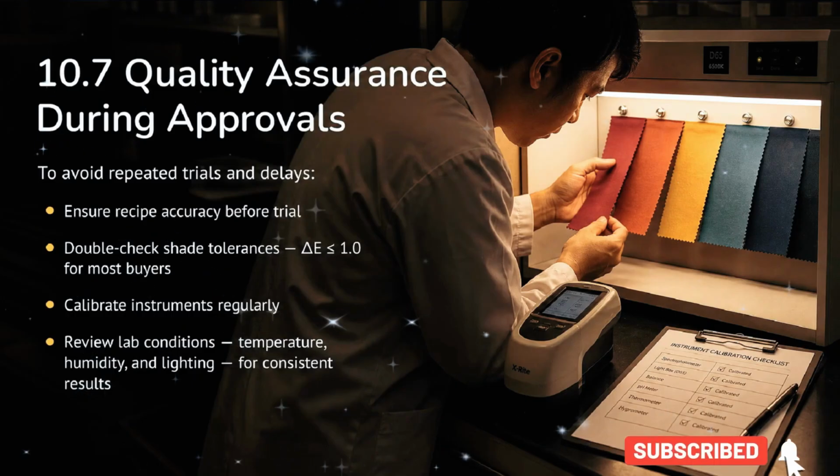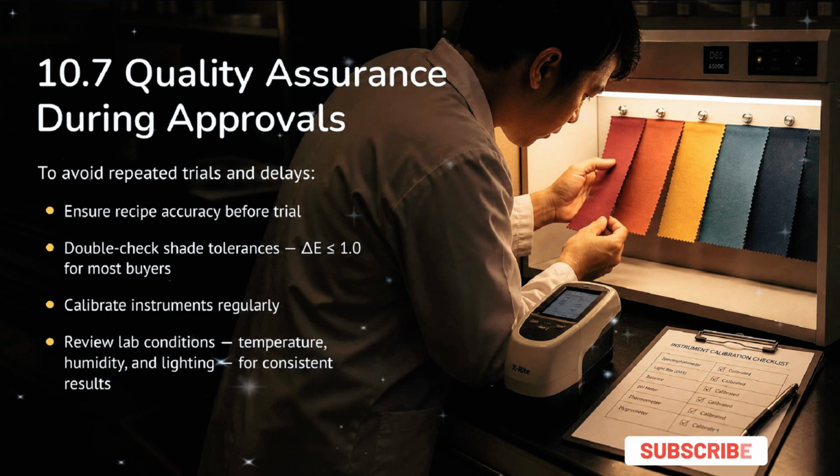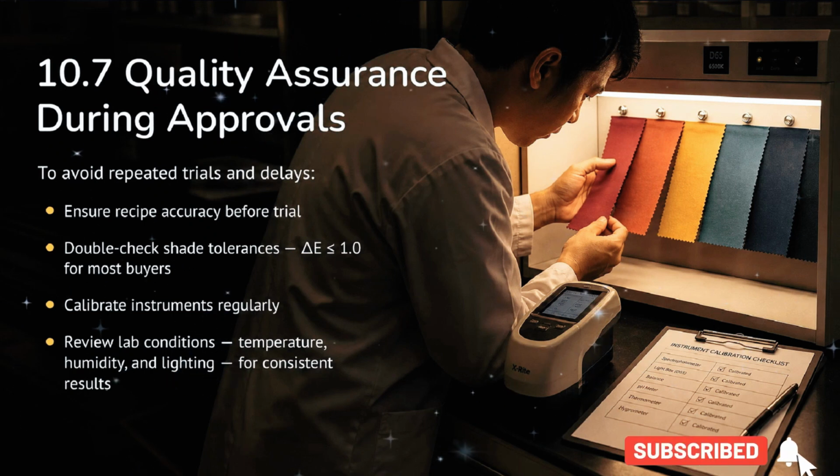Quality assurance is vital to avoid repeated trials. Always ensure recipe accuracy. Verify shade tolerances. Calibrate your instruments regularly, and maintain consistent lab conditions, such as temperature and lighting.